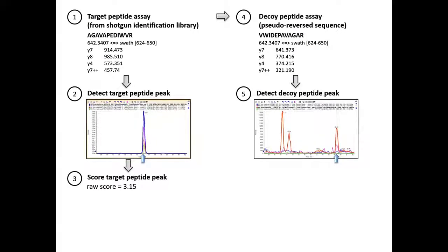Your decoy will actually capture masses which are not decoy masses, they're actually the mass of the target. So there are the proper retention time and the proper relative intensities, and then you start to get trouble. The whole point of these decoy checks that we try to implement is to be as safe as possible that the fragment ions you extract as decoys are real decoys and not potentially true from the peptides.